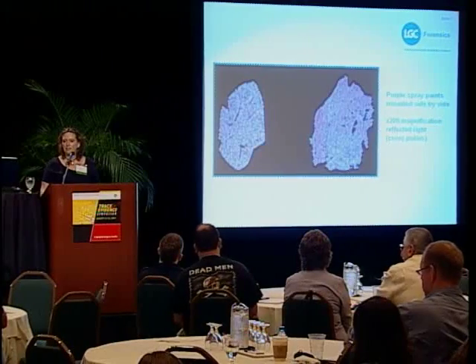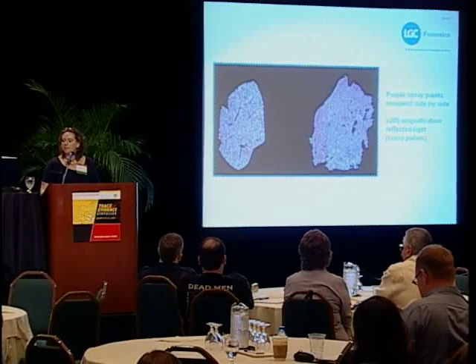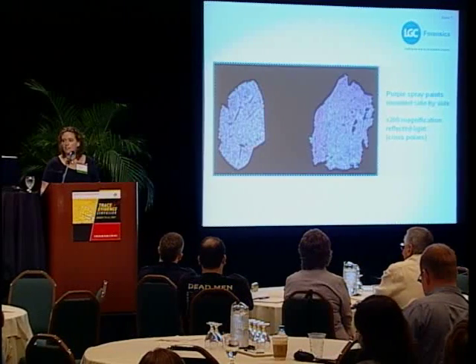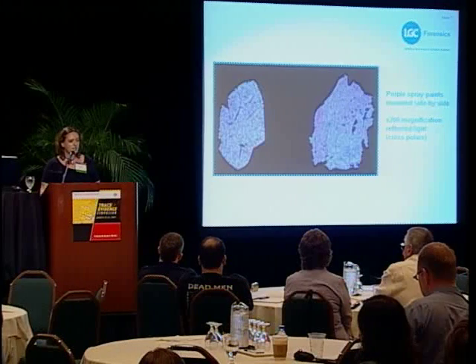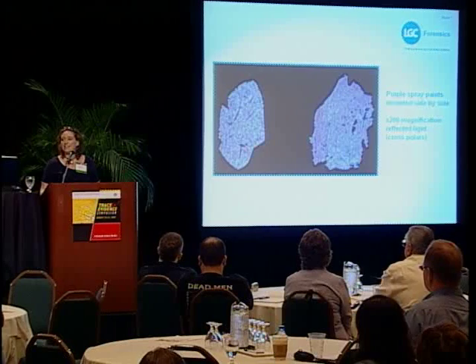into it. The next thing that I tend to do is a full comparison. And by far the best way of comparing paint is by using your eyes. Over the last few days, we've seen many excellent presentations of all the different huge pieces of analytical equipment that are available to us as a toolkit as such. But still the best way for me to look at paint is to use your eyes down the microscope. My boss, Dr. Angela Gallup, produced a paper many years ago where she said that a good human visual expert can actually tell the difference between up to 10 million different colours.